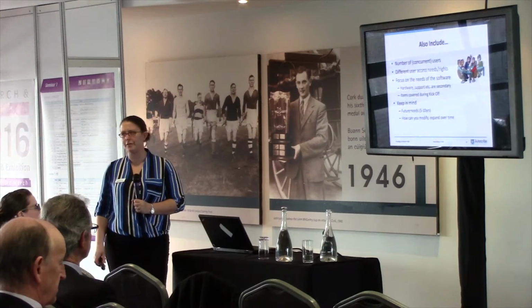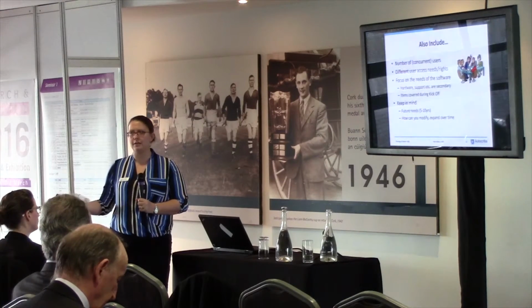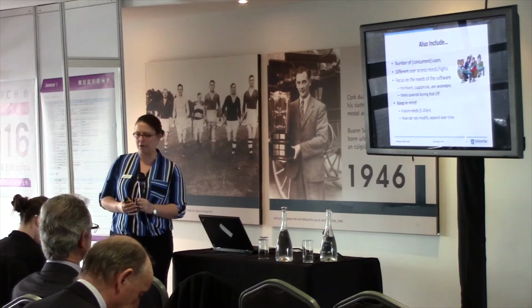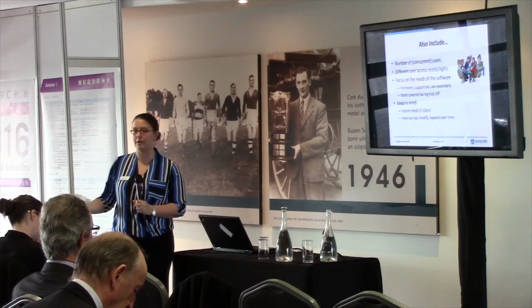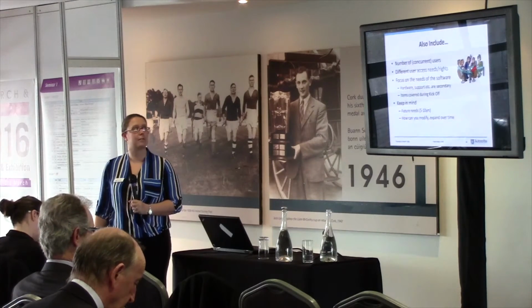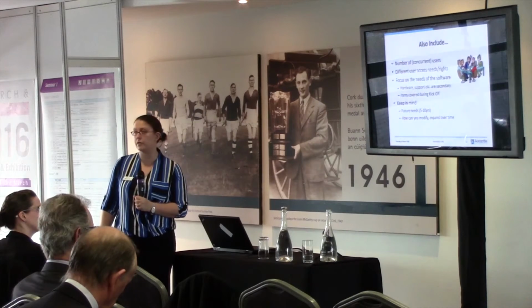No LIM system stays still. It's always going to change. So, 5-10 years time. Now, that seems like a really long time period, because I know a lot of the people I work with, their LIM system needs to develop in a year to 3 years time. It's going to look very different to what it does the day I install it, because things change in businesses. So, the ability to modify and expand systems over time.